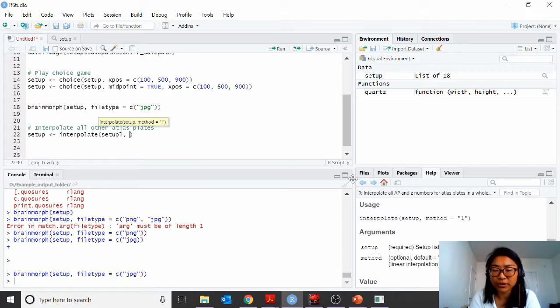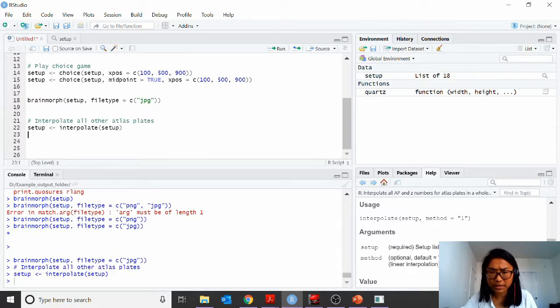No significant difference because the interpolation is all within the qualitative margin of error. Honestly, the difference in interpolation for one specific plate is probably within 10 Z images of each other, so it really doesn't make a difference what method you want to use, but it's there in case you want to.